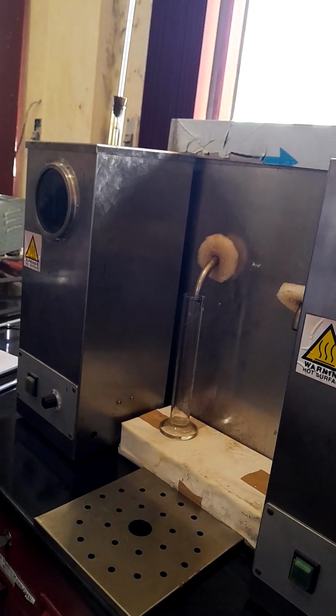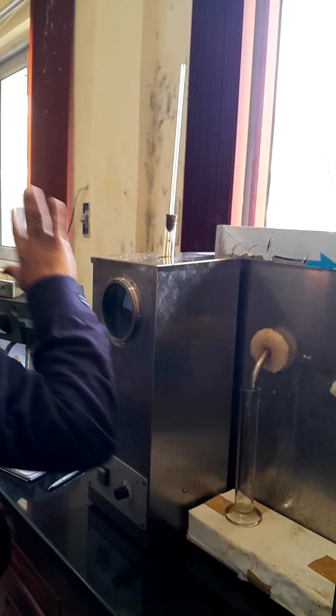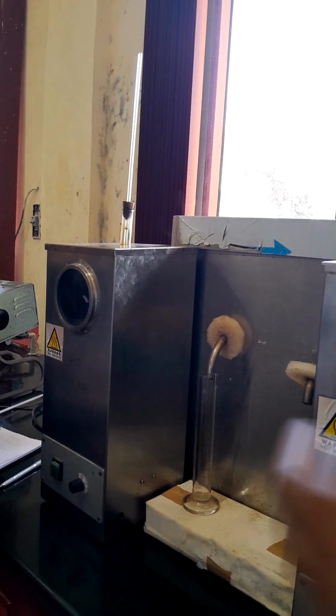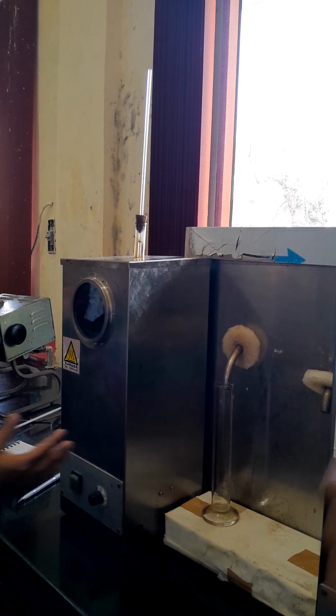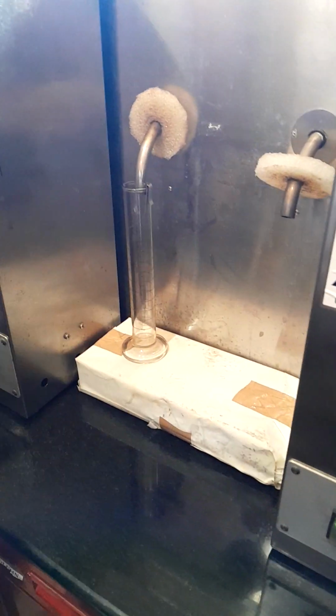So right now what I am doing, I have a diesel, commercial diesel. I have a diesel. For diesel, I am using the plate which has got the diameter of 50 mm. And okay, 100 ml of the sample, and this is my receiver, and this is the condenser. Now it is very important for both the cases.